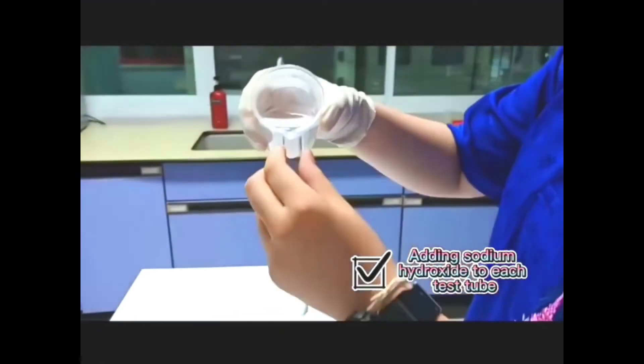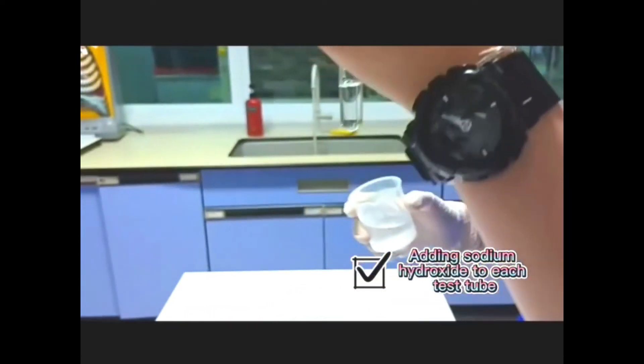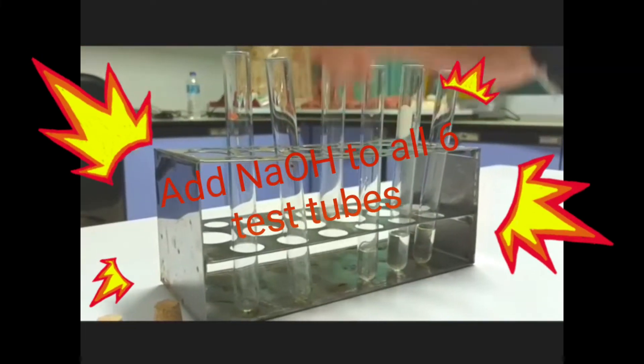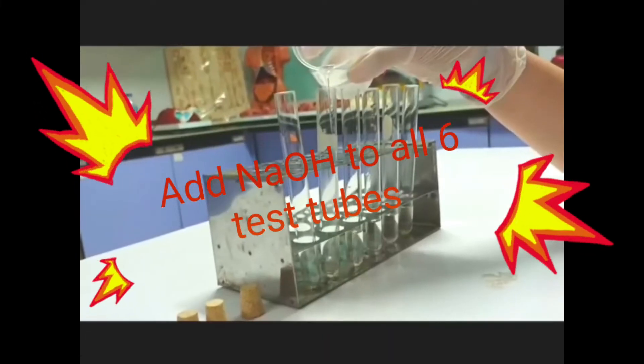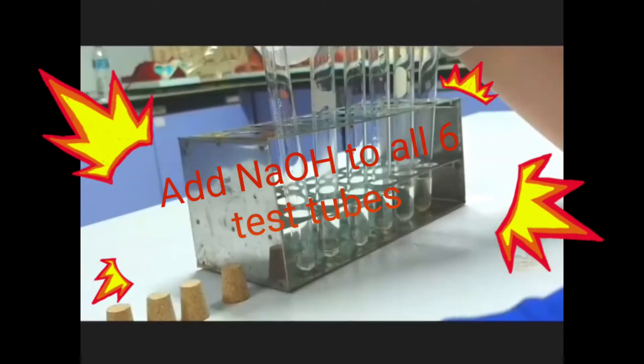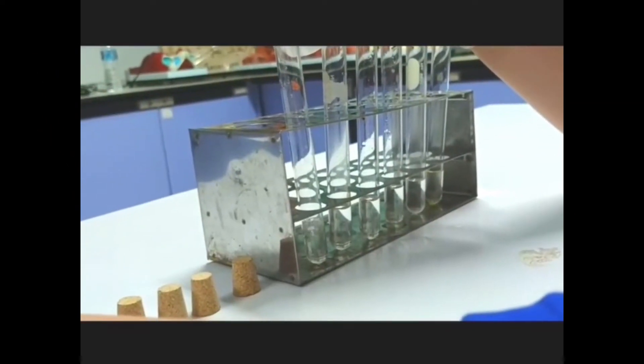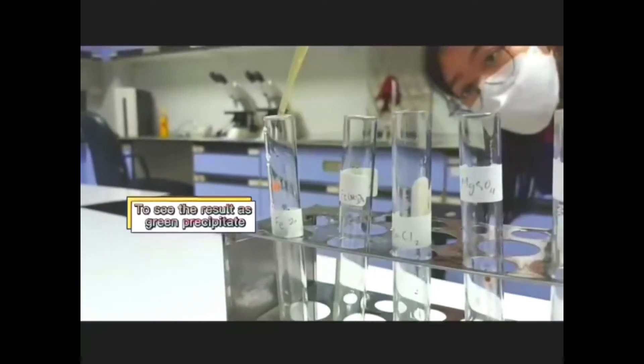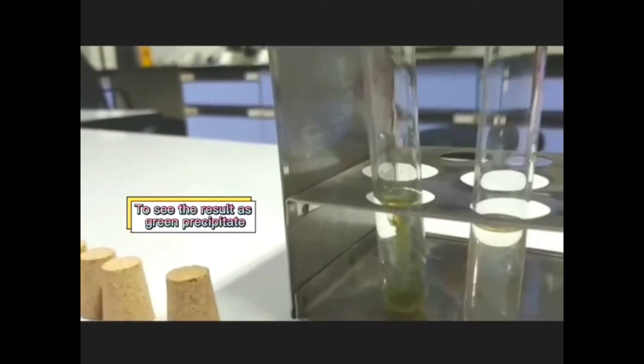First up, we are going to add sodium hydroxide to each test tube. We are going to add iron(II) nitrate to the first test tube to see the results as green precipitate.